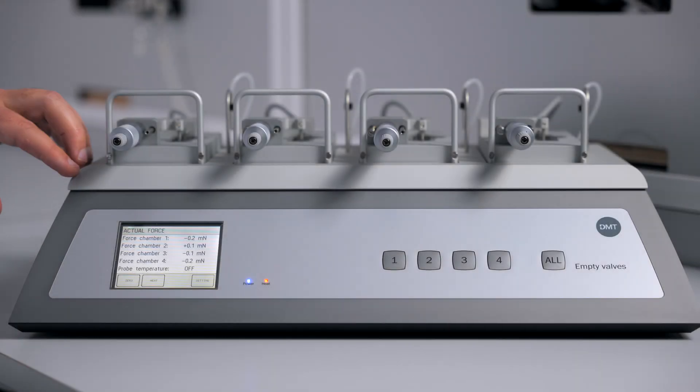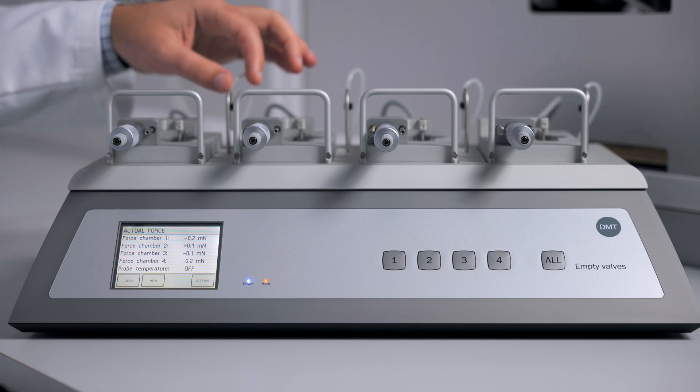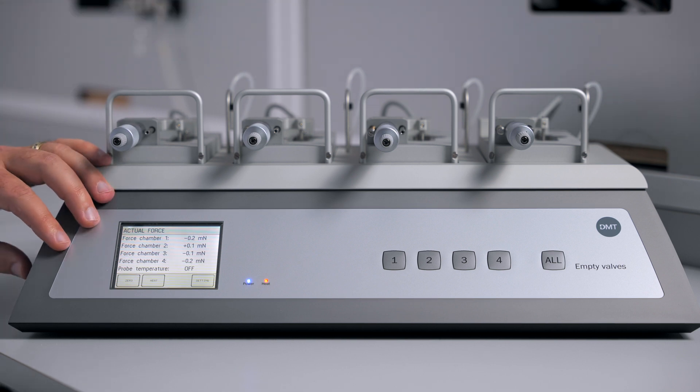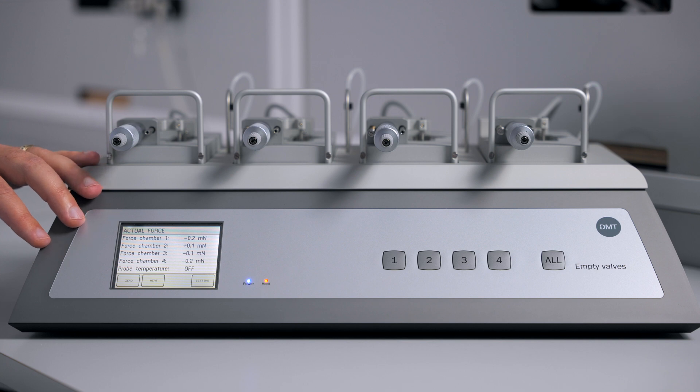We will start with the interface. The interface will provide heating for your chambers, as well as vacuum and gas bubbling in your chambers. The interface will also collect and export the force data from your experiments to your data acquisition system.